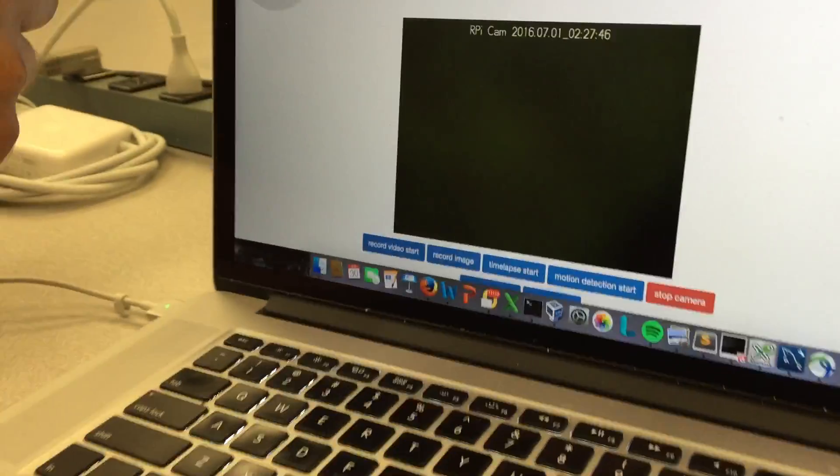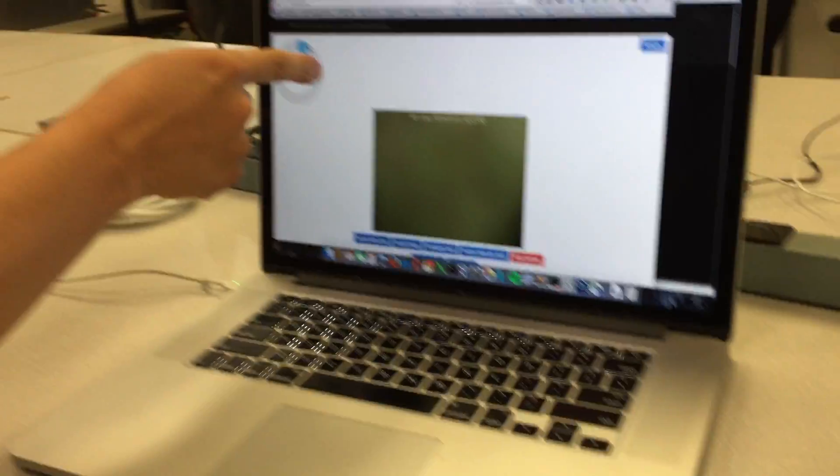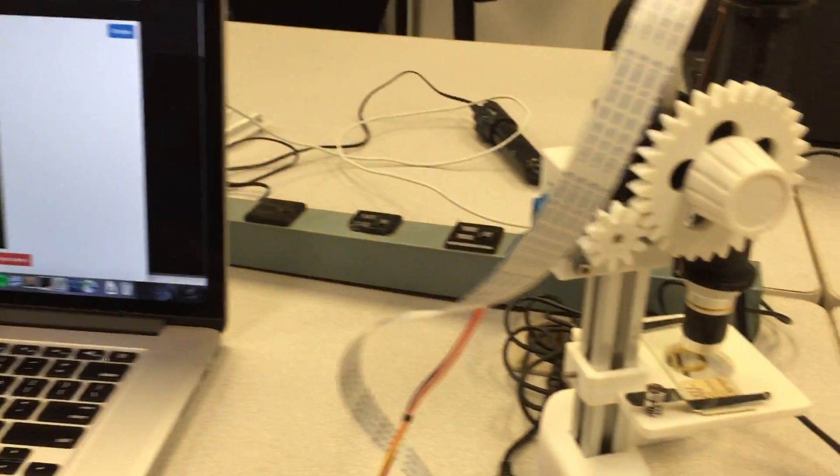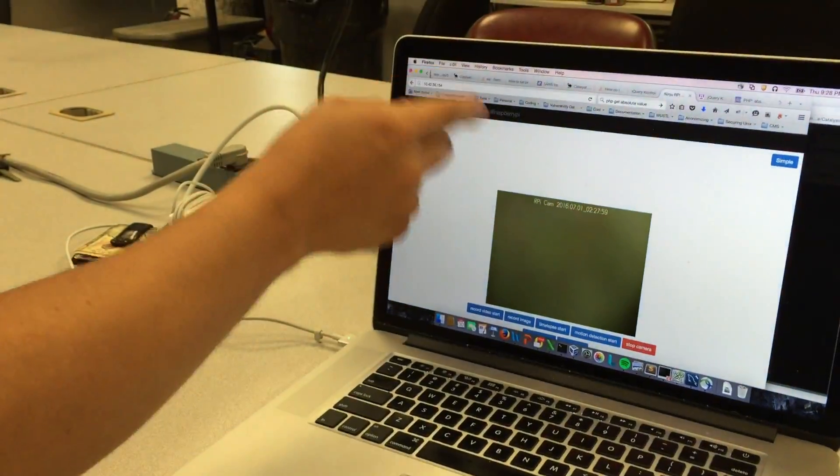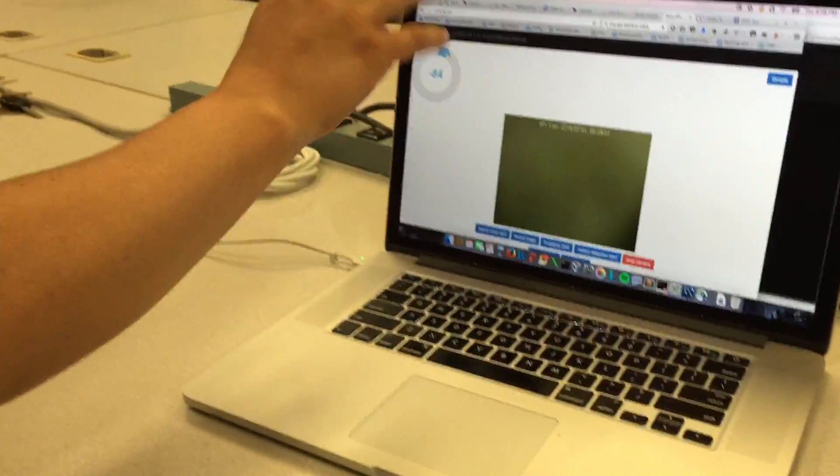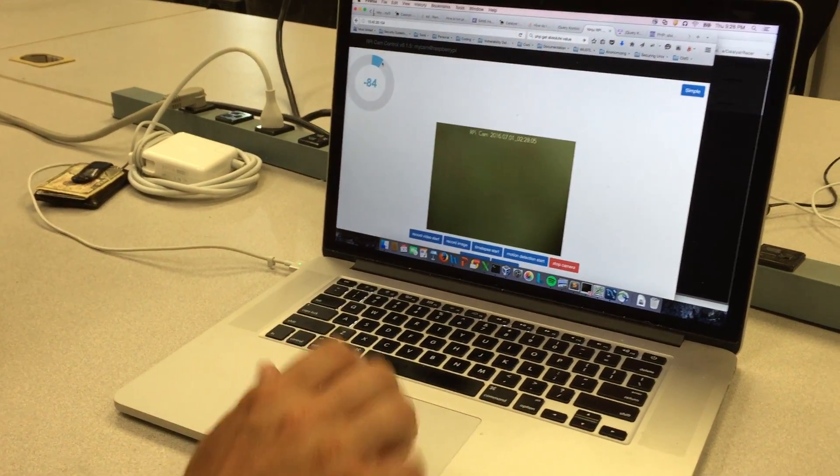Yeah. And what I'm kind of leaning towards is maybe something where with the dial as you get further and further away, the natural tendency is going to be you want faster and faster movements. So rather than it being a linear adjustment, it'll be something more of a logarithmic type of thing where the further away you get it, the more and more it does it. Yeah. Sure.